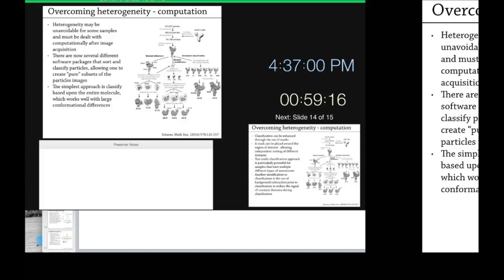Any other questions? One more question, at what level do we talk about reproducibility? In this case it's open and closed, but in crystallography sometimes there is alternate conformation within the same residue. In cryo, can that also be considered as heterogeneity?